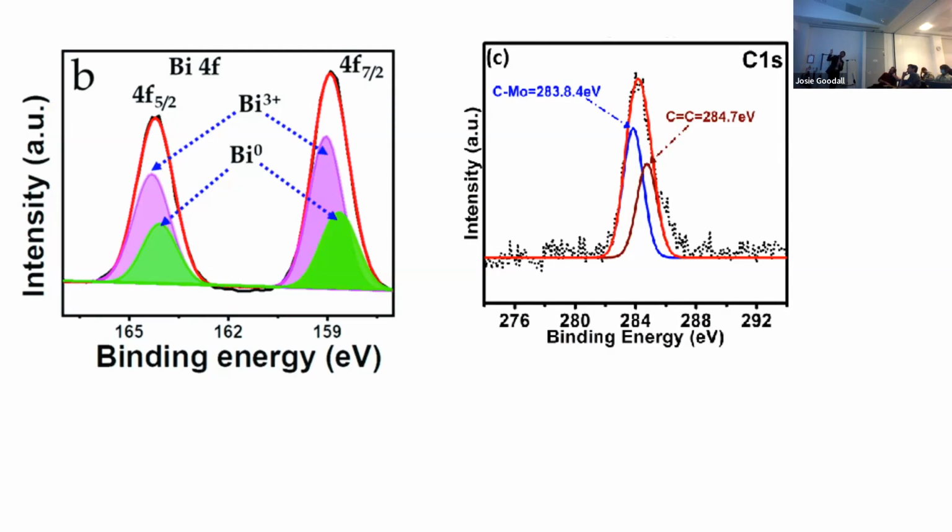In XPS, we tend to, actually this is a point I could have made as well, it can often be very helpful to look at different regions of your spectrum not in isolation, rather than fit them independently.